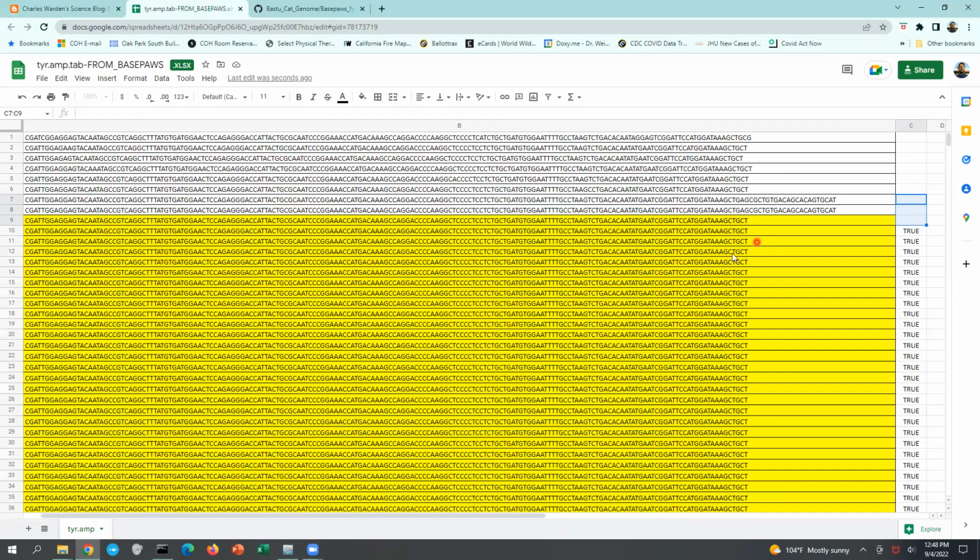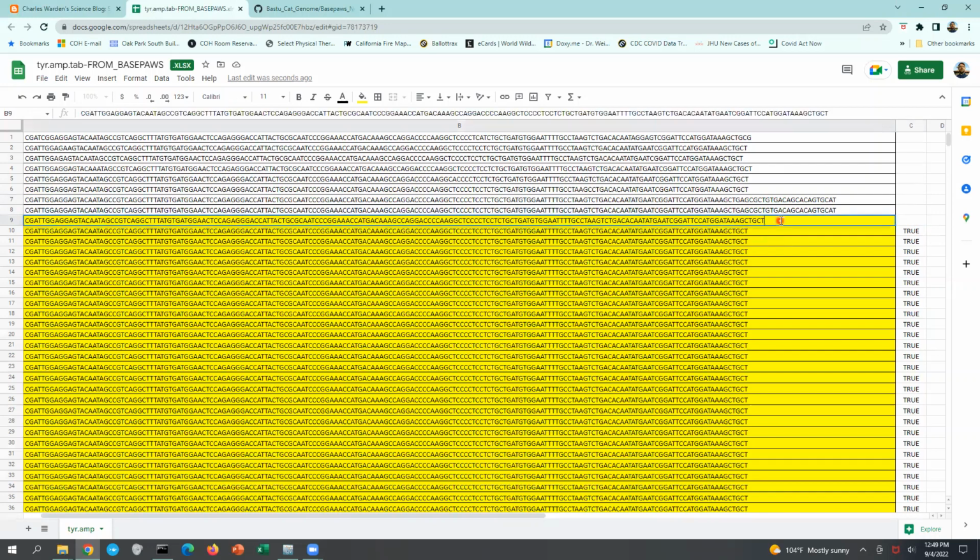And when you look at this, you might think it is more confusing than the whole genome alignment or even that reprocess alignment. And it is a bit more confusing, but as far as Amplicon-Seq data goes, I think it is reasonably good. And I think you should always expect some amount of off-target amplification. And for whatever reason, it's not unusual to have sequences that are not the biological sequence in the amplicons. And I think the difference of the nucleotide at the end is a not so bad example of that.